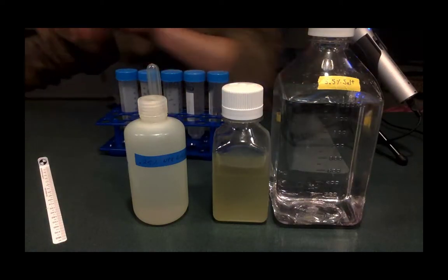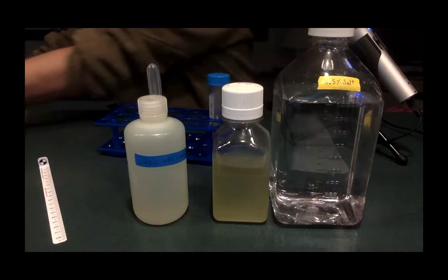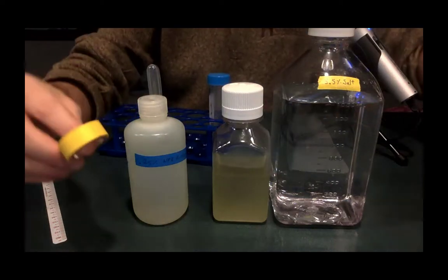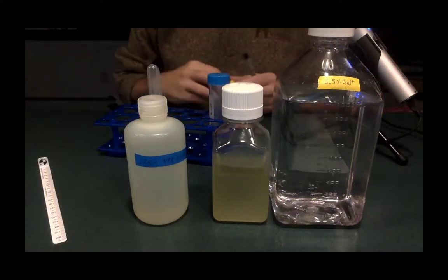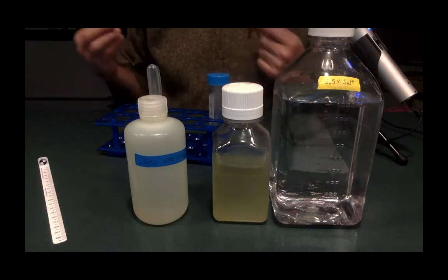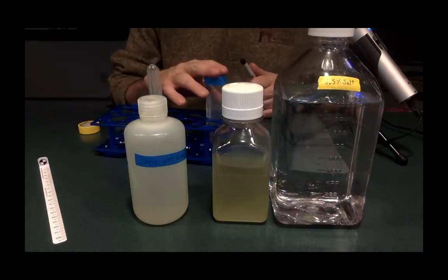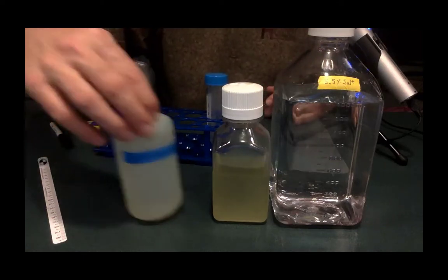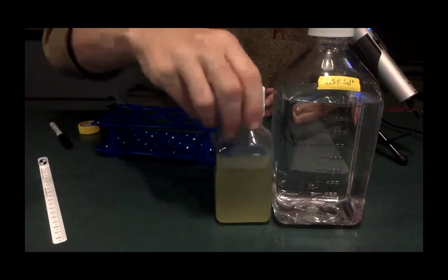And obviously, if I was setting up my experiment, I would get some labeling tape and a marker, and I would label all my different tubes so that I knew what I have. You want to have at least one negative control, at least one positive control, and then you want to have some replicates of your experiment. Again, I'm not setting up an experiment. I'm just demonstrating some of the pieces. So let me move some of the items off to the side.